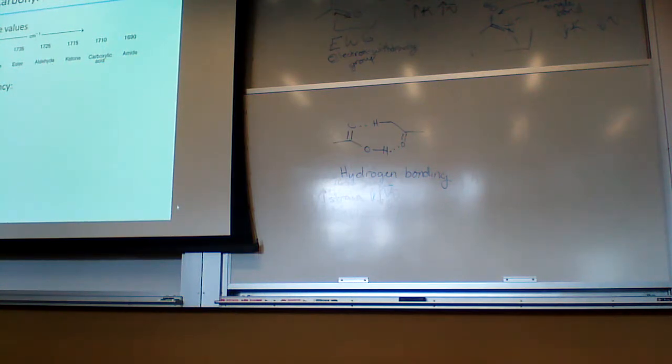So this standard cyclohexanone, a 6-membered ring, is not very strained. It has a stretching frequency of 1715. When we go to the cyclopentanone, a smaller ring, you go up to 1745. So it's going to increase the stretching frequency.